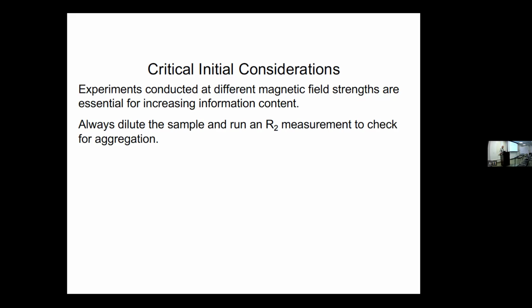oligomerization. Sometimes too, this shows up in profiles in which you see a very large number of residues that show chemical exchange broadening, 1 to 2 per second, kind of uniformly through the protein. And that's usually not some global dynamic process.